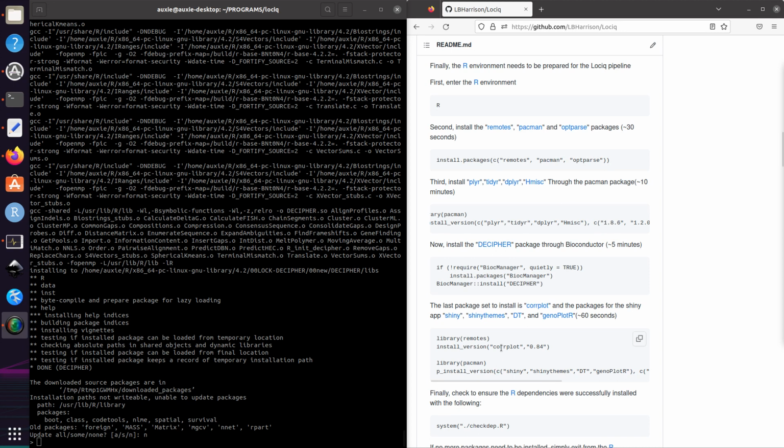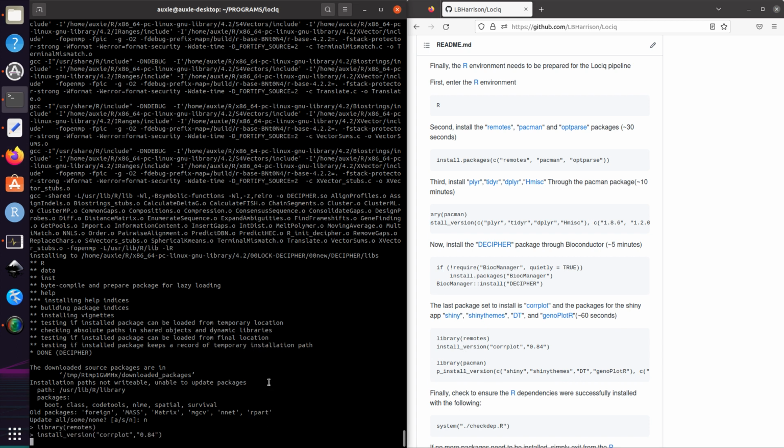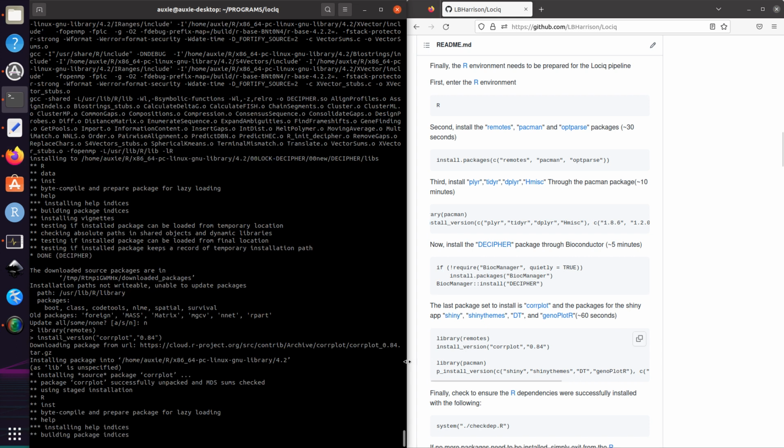So finally, the last step will be installing the visualization tools. So to do that, again, we scroll down to the next text box, I suppose. Go ahead and copy this and paste it into the terminal. And this will take a few minutes.